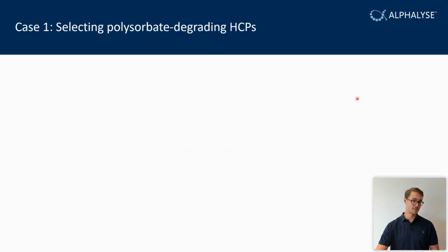So here we have a specific case study of how we actually used this database initially for selecting some polysorbate degrading host cell proteins for an assay.